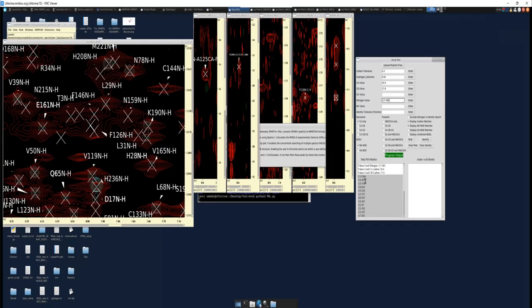So you went from this big list of matches, I think it's like 20, down to basically 3, because you have this similar match. You can do the same thing with the HN or with the CACB. If you run that, you'll basically have these 2 matches.